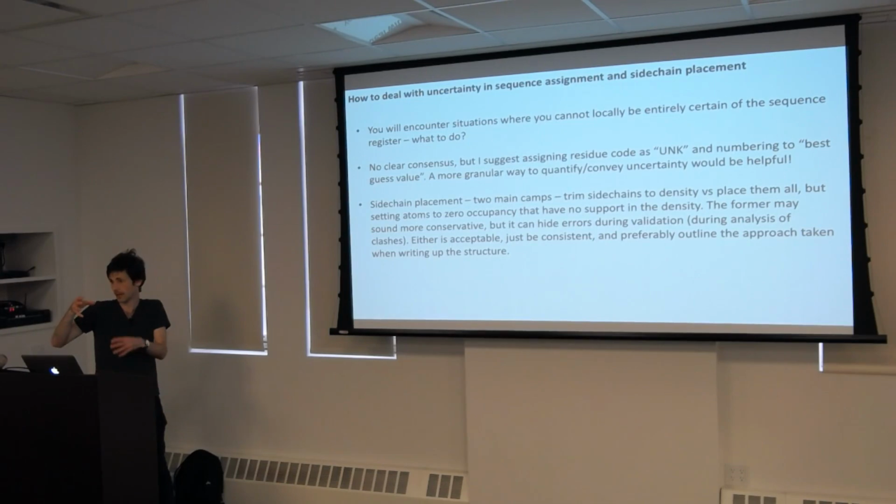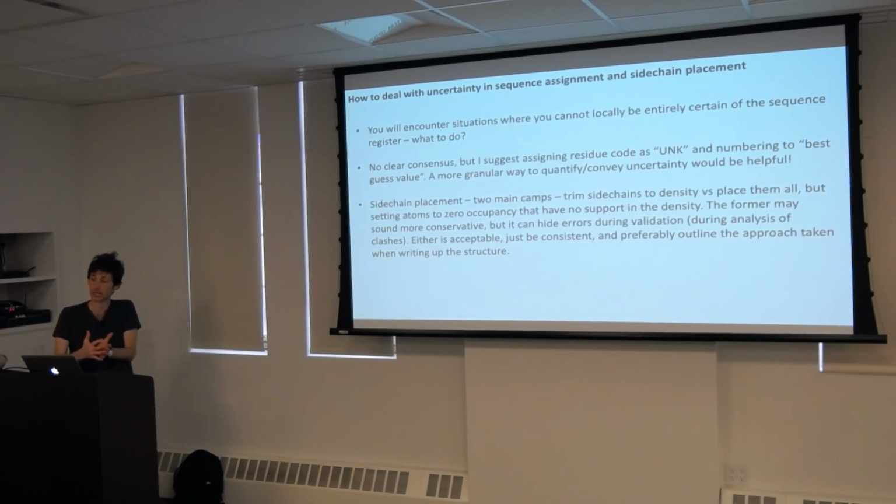If you have a hydrophobic core where you've not placed a bunch of residues, when you analyze that with, for example, MolProbity or anything that analyzes clashes, it doesn't implicitly take into account the fact that your phenylalanine should have a sidechain. It's just going to check it naively. And so that can hide modeling errors quite well.